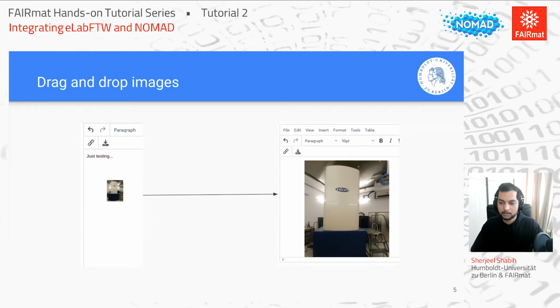So obviously, this is a simple example of what this feature does. You really drag and drop an image into the rich text editor, and it properly uploads it, and you can store information like even Pepe showed. If there's a small screenshot of some data that you would like to quickly place, or a graph, you can easily do that.